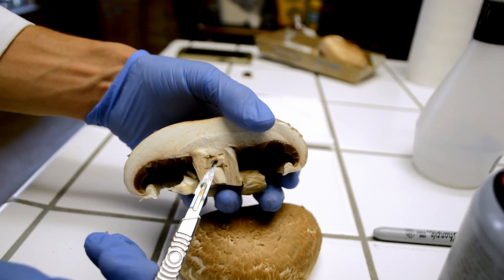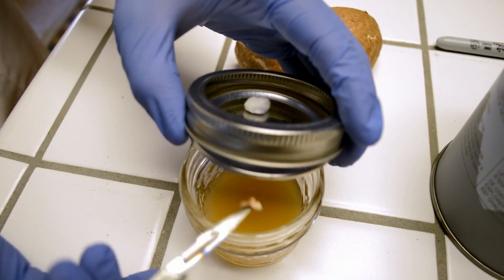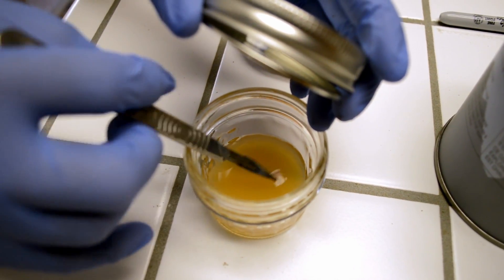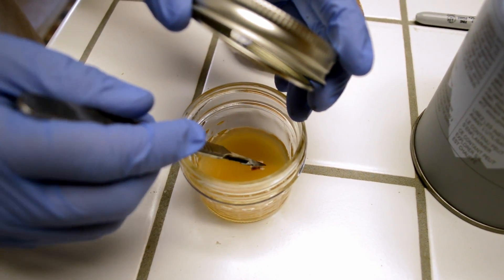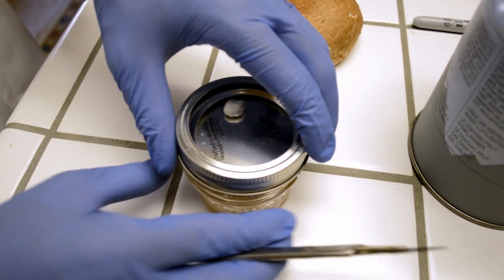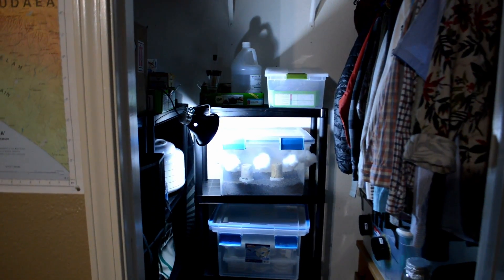Now simply crack open your lid just enough to allow you to wipe the tissue onto the agar. A few tips that will give you the highest chance of success: first, don't completely uncover your plate in order to prevent any falling contaminants from infiltrating your culture or landing on the inside surface of your lid. Second, do your best to keep your hand from hovering over the top of the agar. Instead, hold your blade like a fork to keep it as far from underneath your hand as possible. Once you've placed your tissue, seal your lid and place it in a cool dark place.